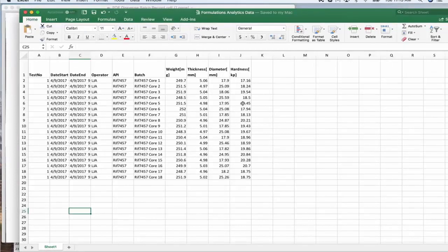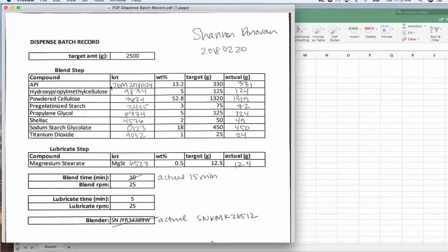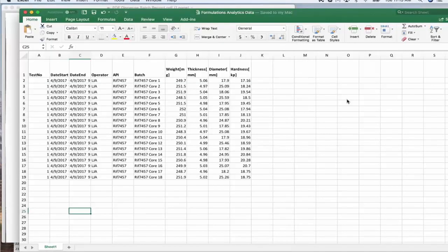They were really struggling with this because it was spread across lots of different people. The PDFs weren't even mineable, so how would they even find this information to begin with? And how does this data connect to the analytics data? It just really was almost impossible for them to pull this data together. So let me show you how we solved their problems using Riffyn.